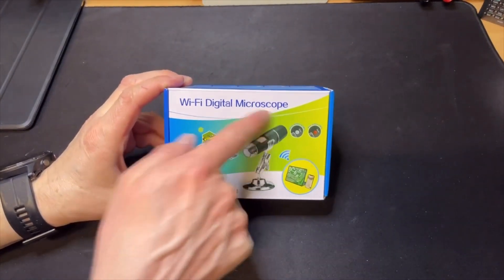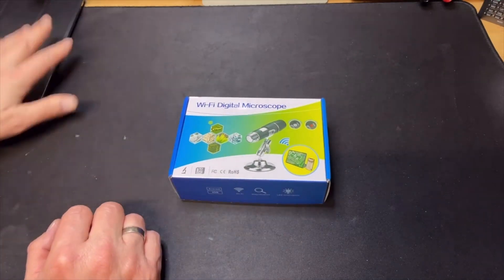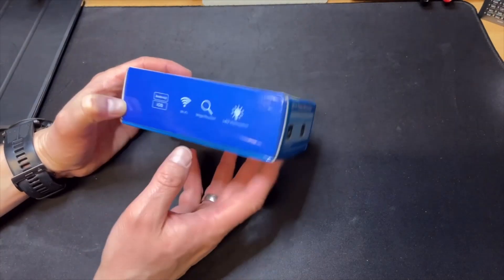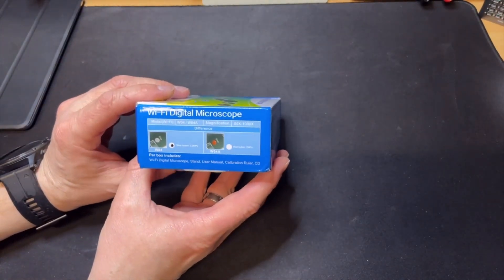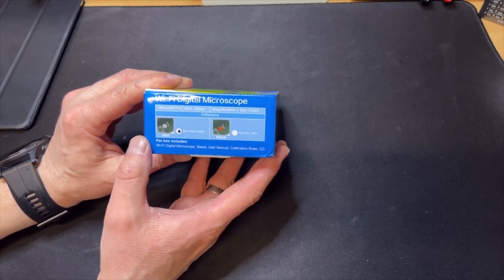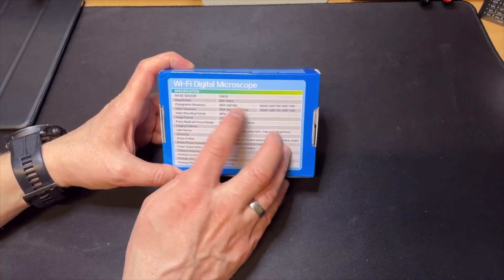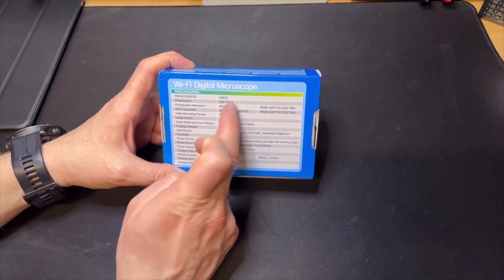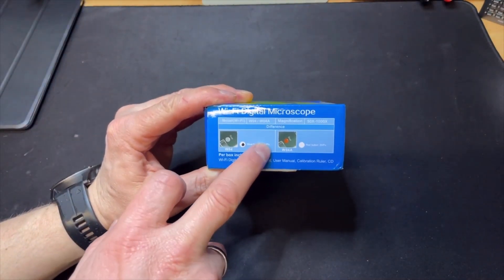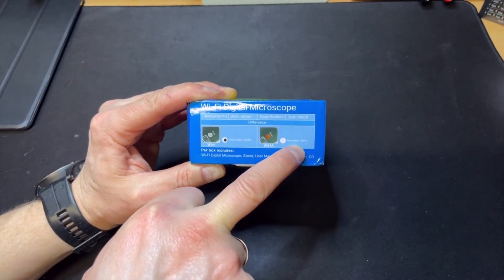Here we have the box — Wi-Fi digital microscope. You do need a tablet, so I have my old iPad here. I will guide you through the installation process. There are two versions, which is a bit confusing: this one is 0.3 megapixel and the other is two megapixel.